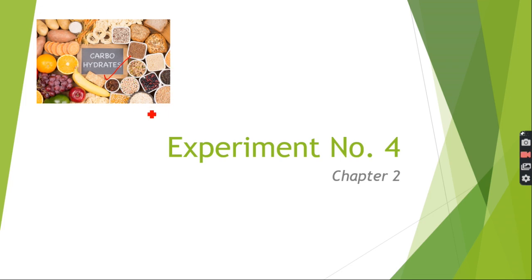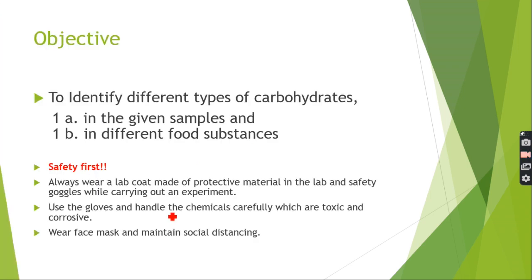So in the picture which is given over here, you can see several sources of carbohydrates, different types of carbohydrates. So let us see what we are going to do in the experiment today. Our objective today is to identify different types of carbohydrates.